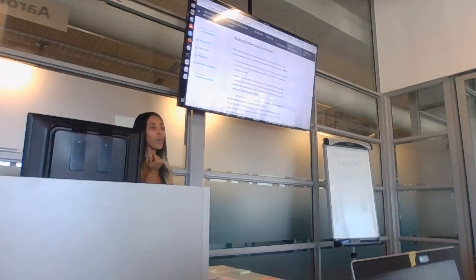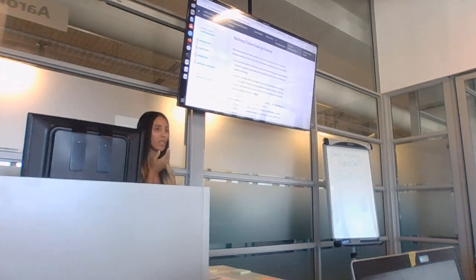Can you think of why one would want to make a collection? It is a simple answer. I just want you to answer. What is a collection? What do you think we would call it if it was on your desktop? Directory or folder. Directory, folder, but what would you call it? Are there any other words that you can call it?